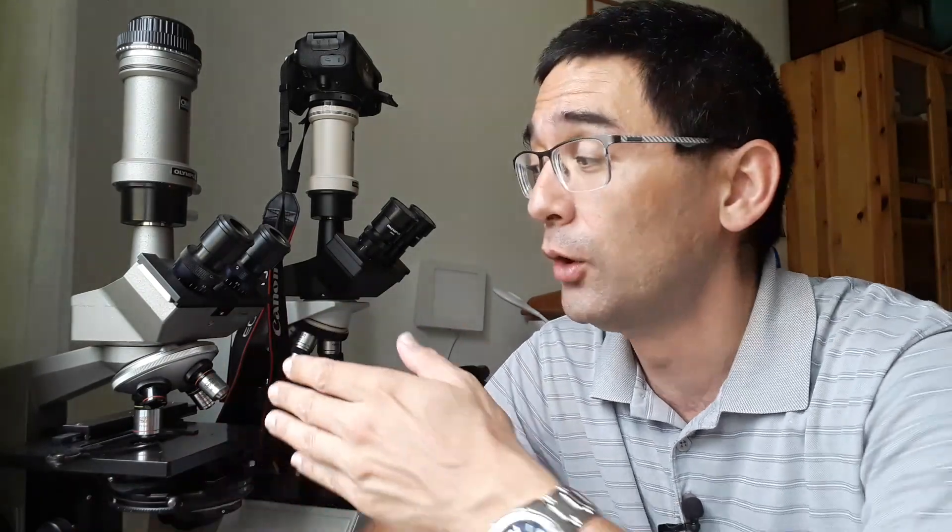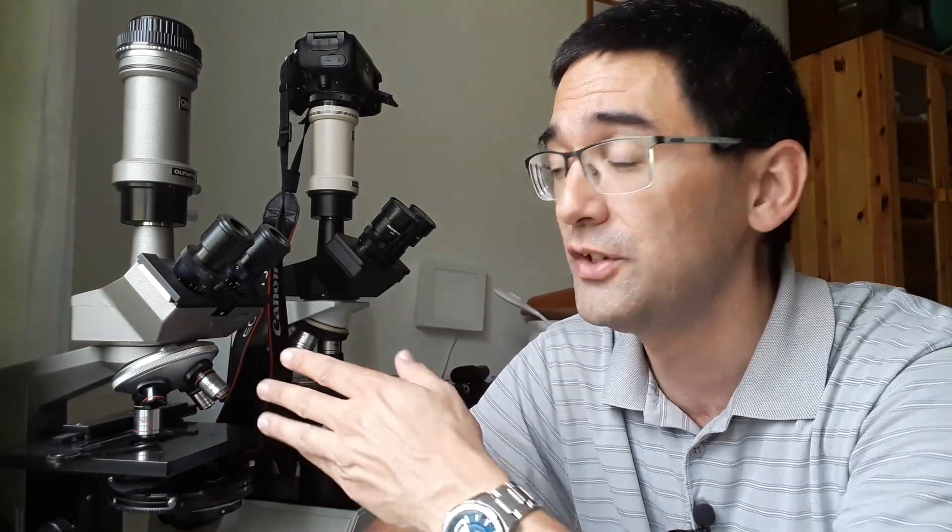Because it's like this that the microscopes or the optics at least, objectives, these are the objectives here, it is like this that they are often manufactured in China. And then if I were to start a microscope company now selling microscopes, what I would do is I would simply buy a whole bunch of these optics, these objectives, and then I would simply fit them on my microscope and then I would simply brand them under my name or under my company's name.